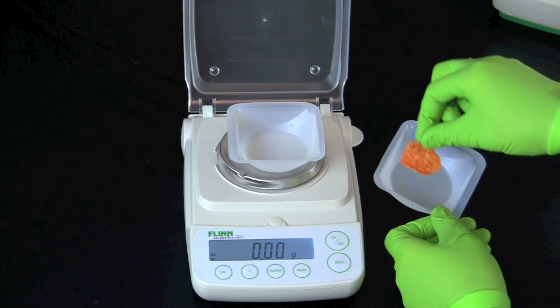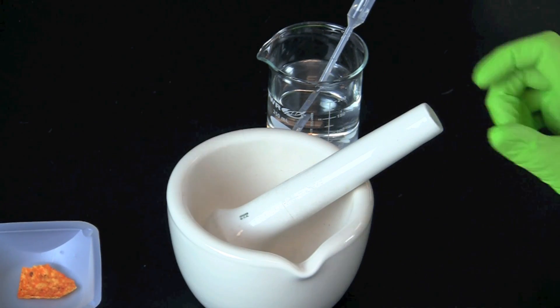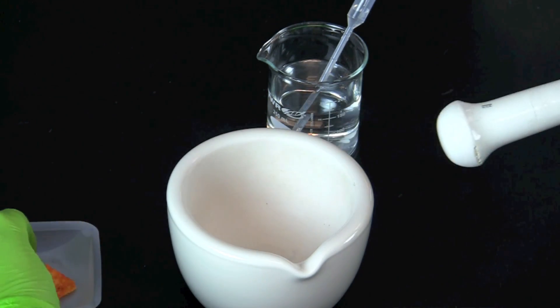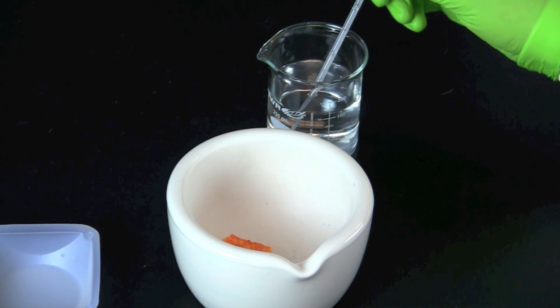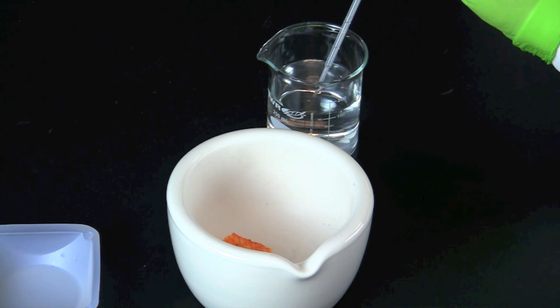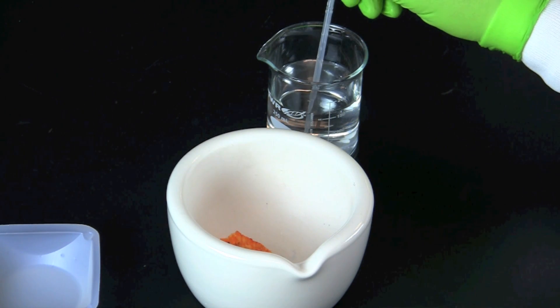Weigh your food sample from the grocery store and record the mass. Put the food sample into a mortar. Add 5 milliliters of distilled water for every gram of food. Since our sample weighed 1 gram, we are adding 5 milliliters of distilled water.